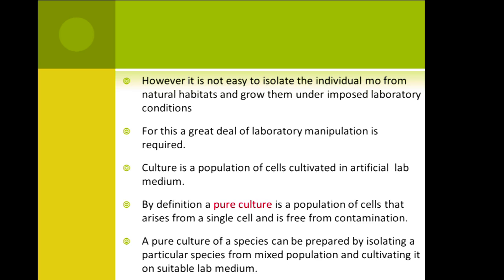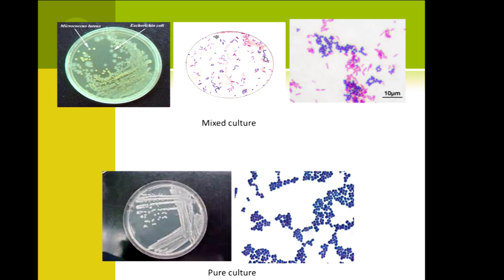By definition, a pure culture is a population of cells that arises from a single cell and is free from contamination. A pure culture of a species can be prepared by isolating a particular species from a mixed population and cultivating it on a suitable lab medium.